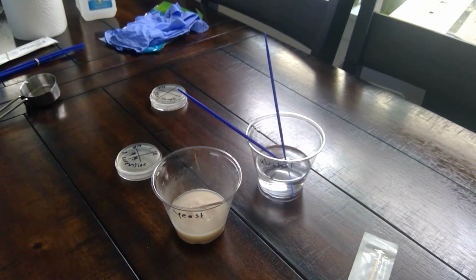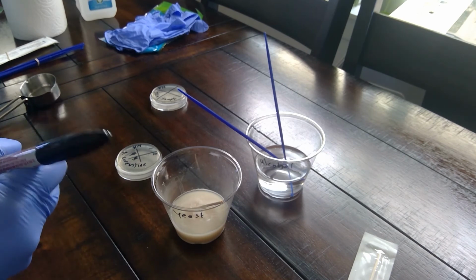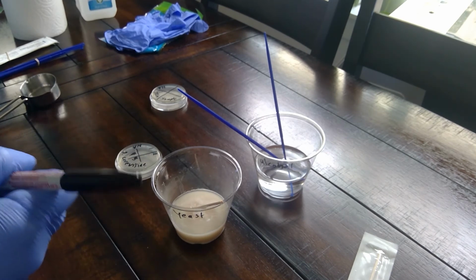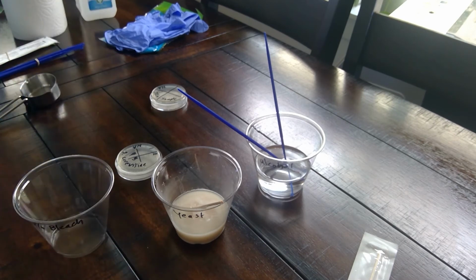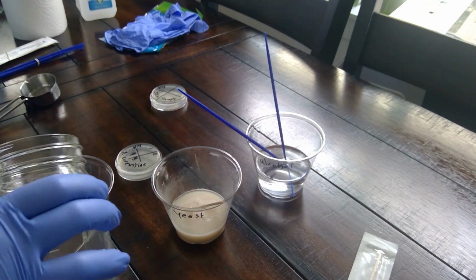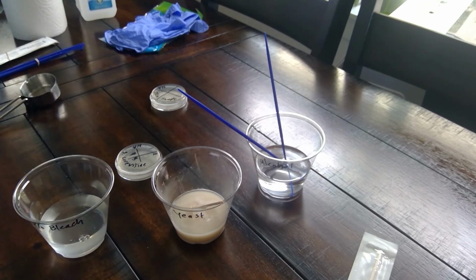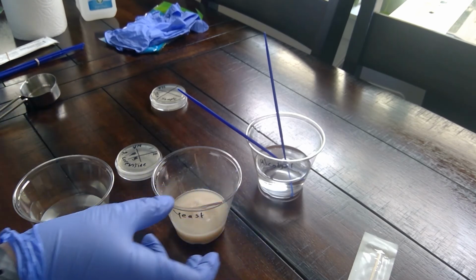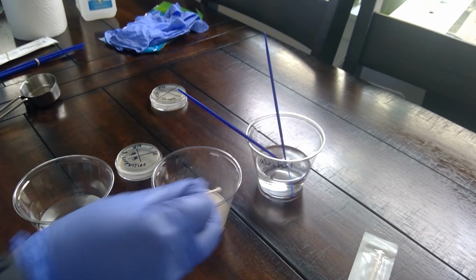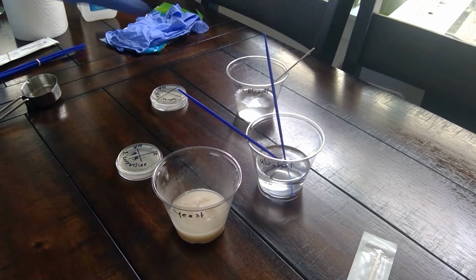And then step 14, place the swab in a 10% bleach solution. I'm going to label a third cup 10% bleach, and then I'm just going to transfer some of my 10% bleach into it. So once this is done, you can just stick it in the bleach, and that'll be our waste, basically.